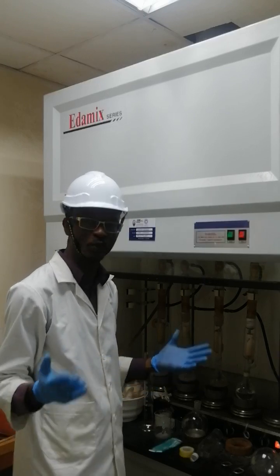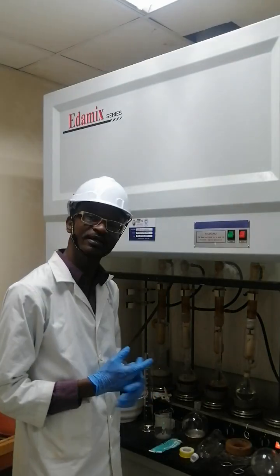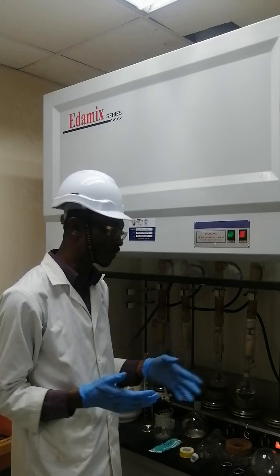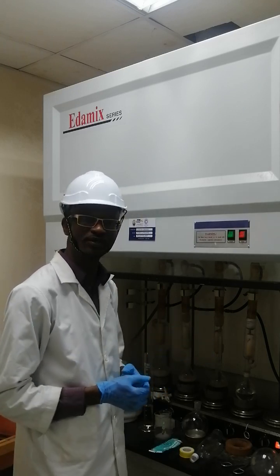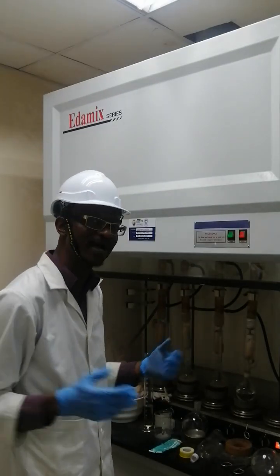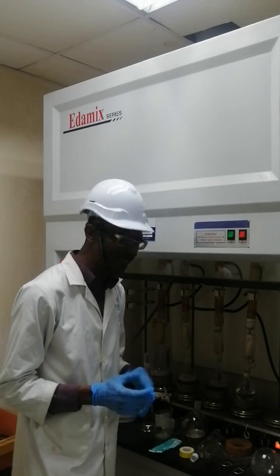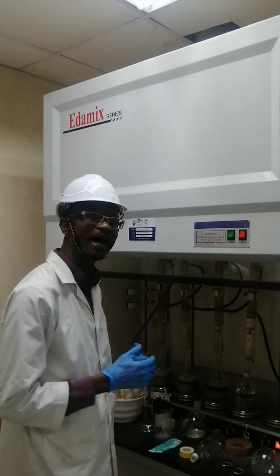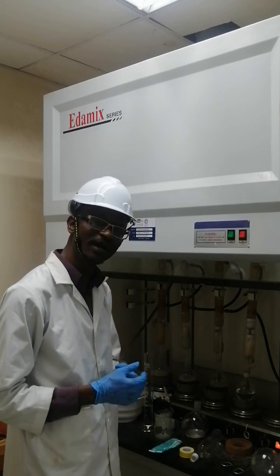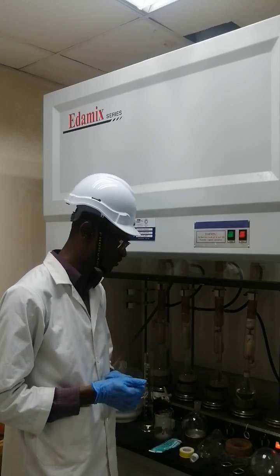How then? But there is water. So how then do we carry out our extraction? There are other ways of supplying water to the condenser for cooling. So maybe in a separate video we'll look at that. But for today, there is a safety tip I want us to observe when we are using the Soxhlet apparatus.